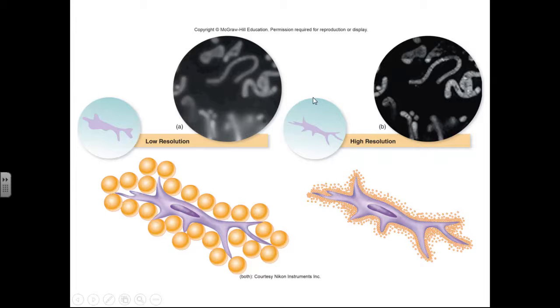I remember my first microscope would magnify up to 600 times, and it cost $20. It just had really, really low resolution. The optics were terrible, so you really couldn't see anything. Even though it was being magnified at 600 times total magnification, you didn't know what you were looking at. To get a microscope that can have high magnification and high resolution, that's something that's desirable, and that's something that's going to cost a lot of money.